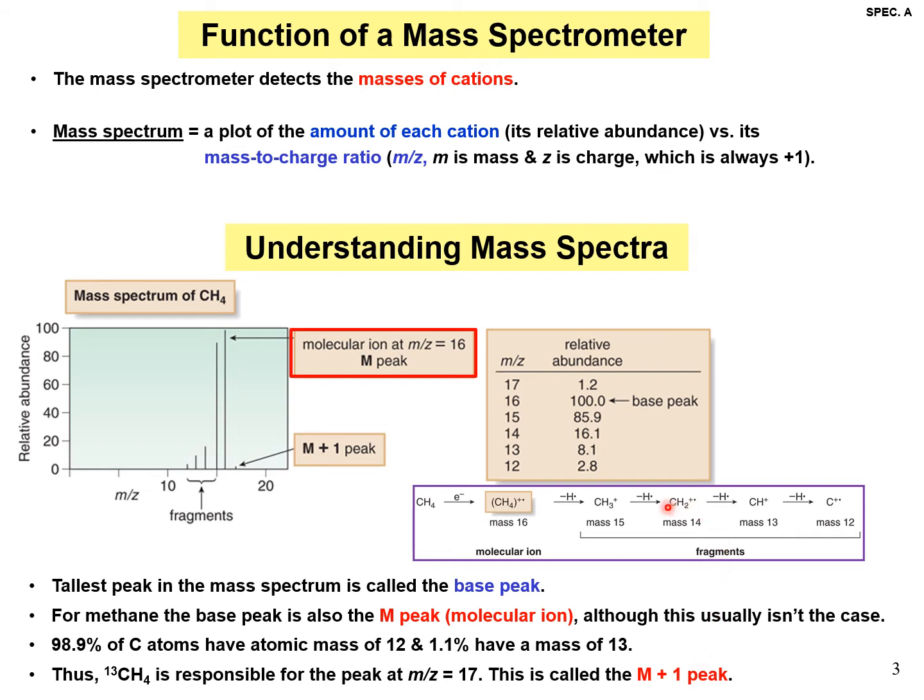One thing I want to point out also is that mass spectrometry occurs in the gas phase, and in the gas phase you will see species that exist that don't normally exist in the solution phase. For example, here we see peaks for CH2, CH, and even C, things you would never ever see in solution chemistry, but they exist in the high energy world in the gas phase.